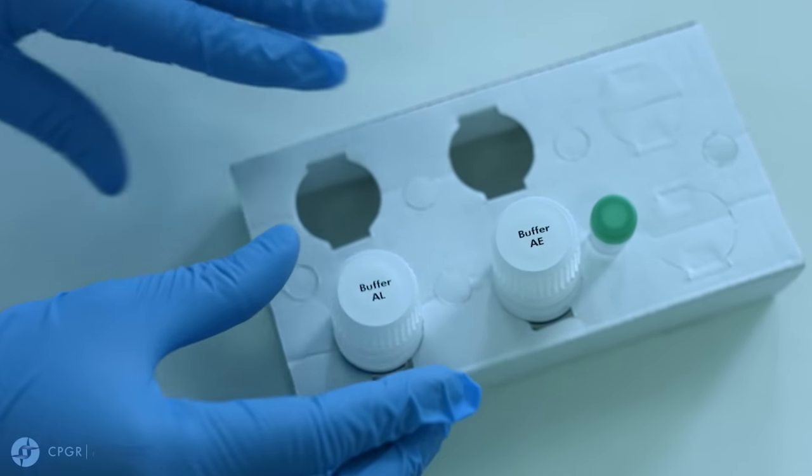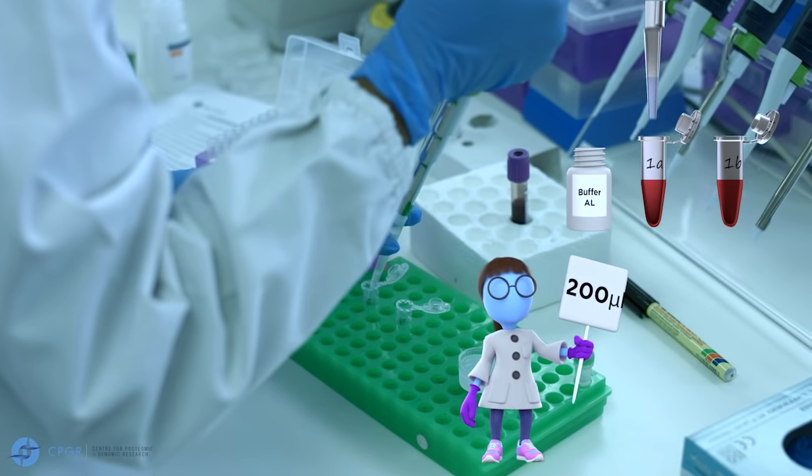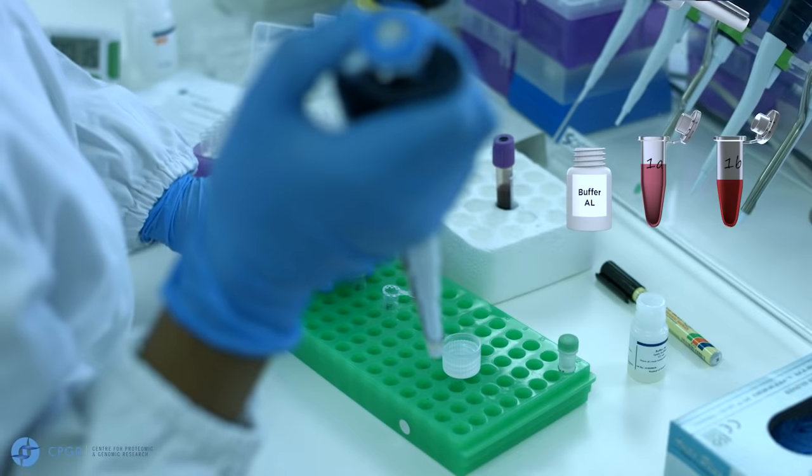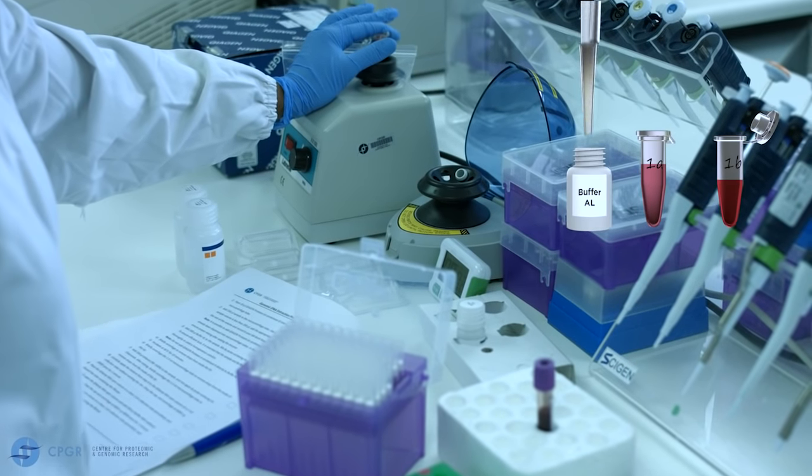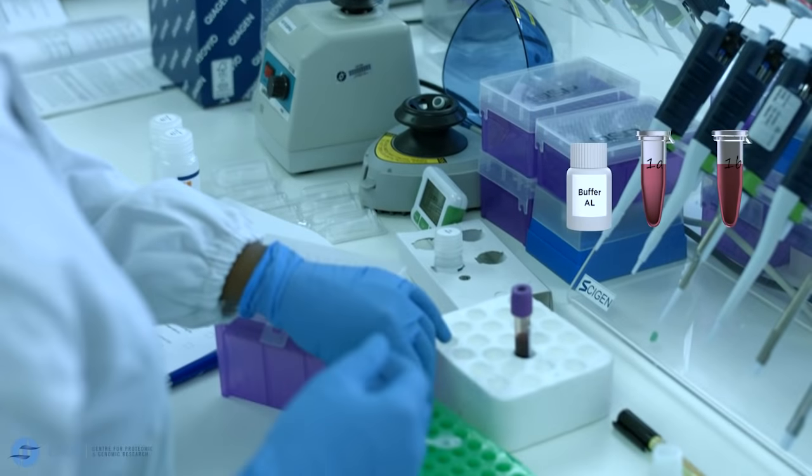Add 200 microliters of buffer AL to each sample. Close the tube and vortex for about 15 seconds and this step will be repeated for all subsequent samples.